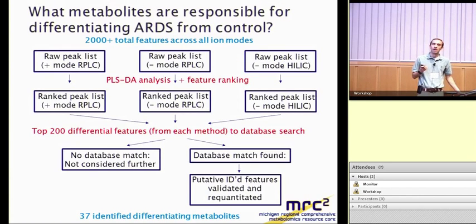You have to frame what you do here, whether you take the top 200 or whether you take everything and try to do a database search, whether you take only the things that are statistically significant by some threshold after the ranking. All of that has to be determined, and can be tailored based on your particular analysis and what gives you the best results. But the basic idea is the same. It's a great idea, if you can, to go back, if not rerunning your samples in a targeted manner, at least checking the quantitation and validating the features that are of greatest interest, to really confirm that you know what you're looking at.